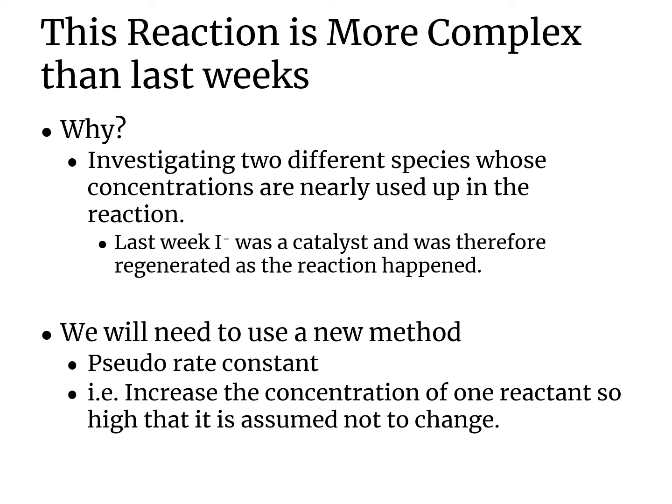We noticed that the iodide catalyst was not used up in the reaction, and therefore we were more concerned with the concentration of the hydrogen peroxide that was used up, but we only examined the rate of the reaction in the segment of the first few minutes when the reaction was happening.